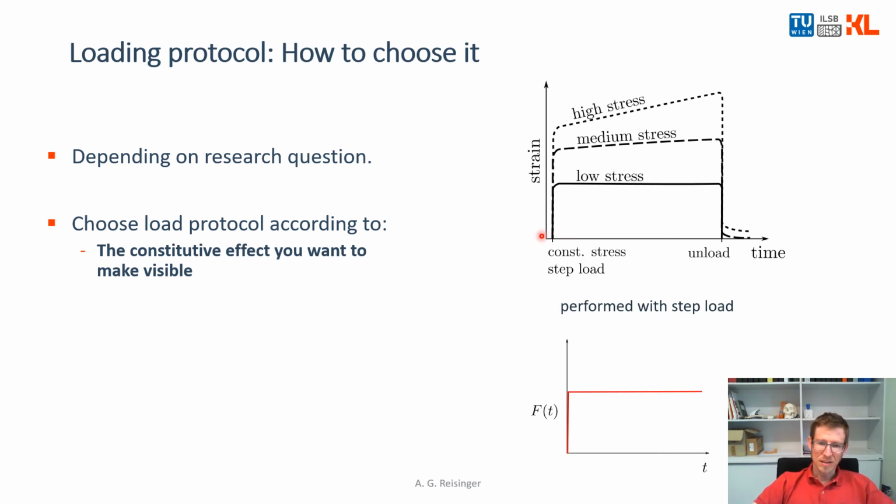Yeah? And a step load in stress, so in force here. So F was increased in a stepwise fashion and held over time. And the deformation was tracked and then transformed into strain. And this is what you see here.